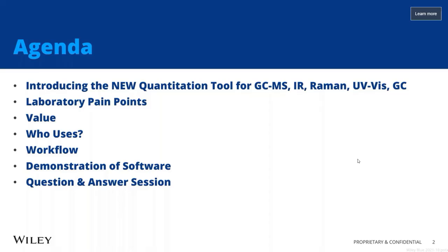Then I'll be talking about who would want to use this software, the workflow that the user would use to accomplish quantitation. Then I'll be giving a demonstration of the software, and at the end we should have time for a question and answer session.